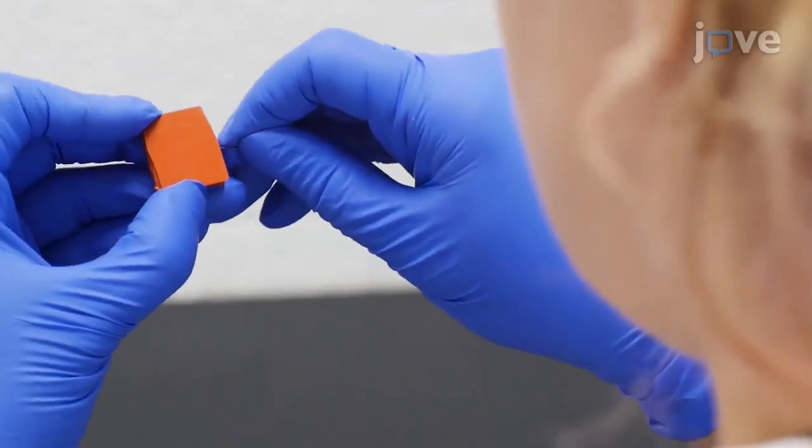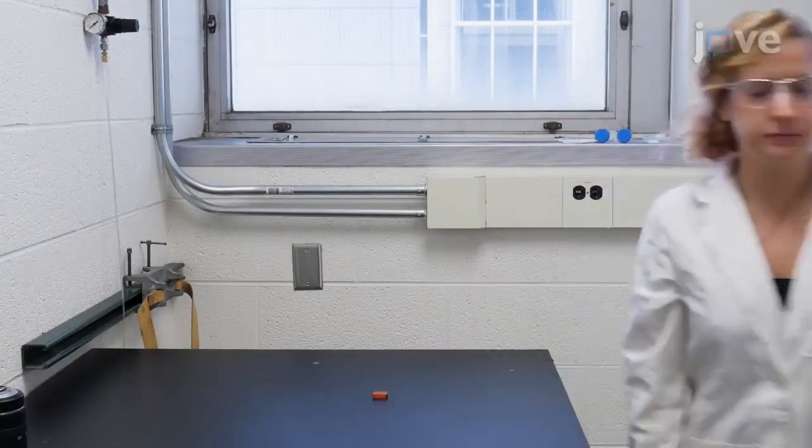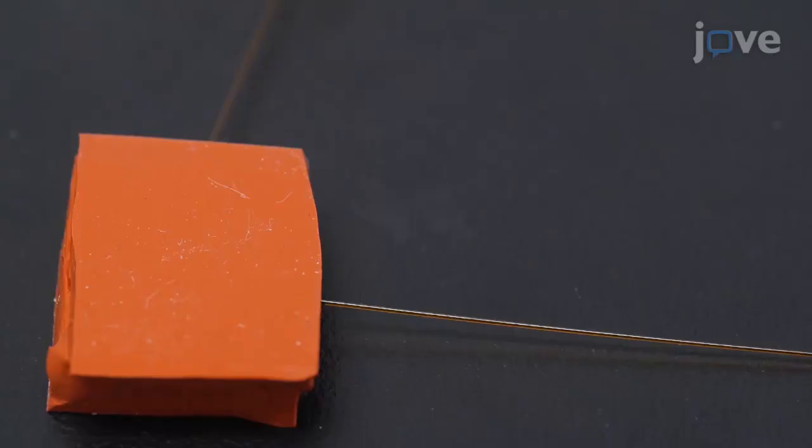Seal both ends of the capillary with silica rubber. After incubating at room temperature for at least 24 hours, continue with the linear polyacrylamide coating on the inner wall of the separation capillary as described in the text protocol.